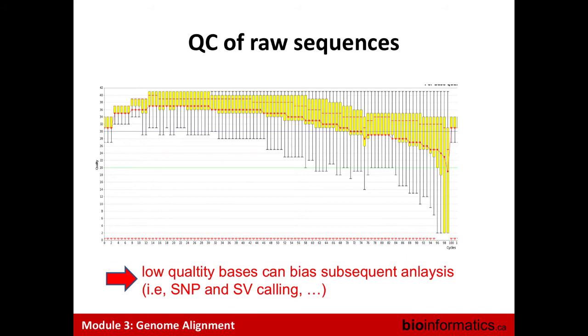Why is that? It's because of a phenomenon that we call phasing in your cluster, which means that all the sequences in your cluster will not integrate the next bases at the same time. There will be a small delay between the different sequences in your cluster. In the first cycle, the difference is so small that it makes no difference for the cluster.